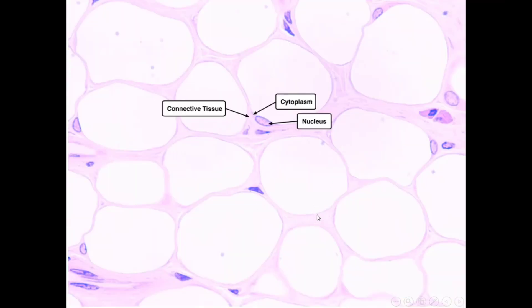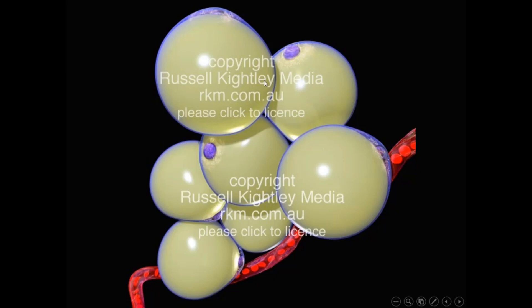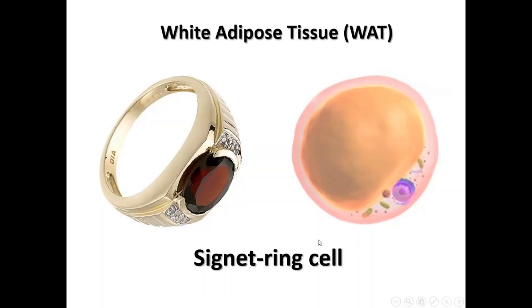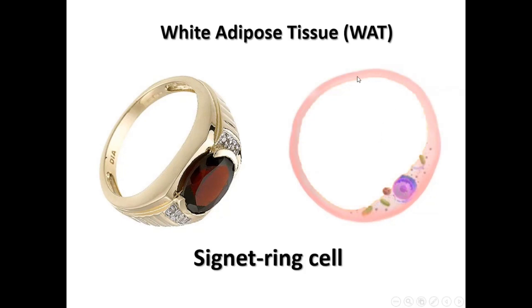In another picture of adipose tissue, the extracellular matrix is preserved very well around the cells. You can see the peripheral nucleus and one big lipid droplet inside the cell. The appearance of the white adipose cells is very similar to a signet ring, especially when the lipid is removed by alcohol or xylene, leaving an empty cavity inside the cell. So we call the cells of white adipose tissue signet ring cells.